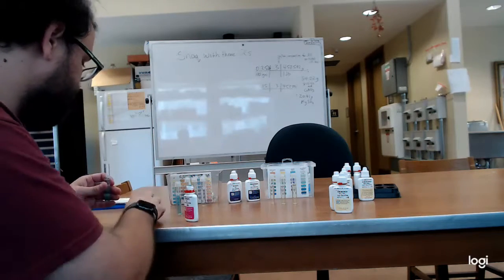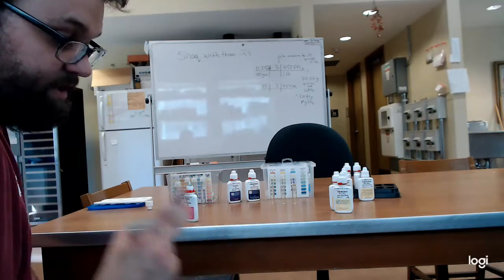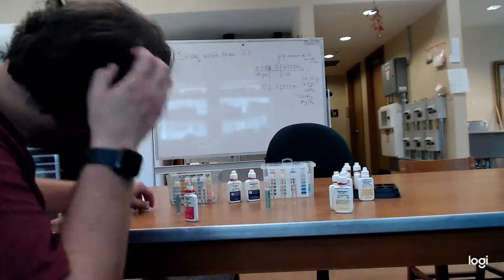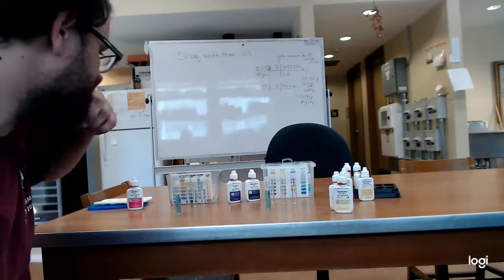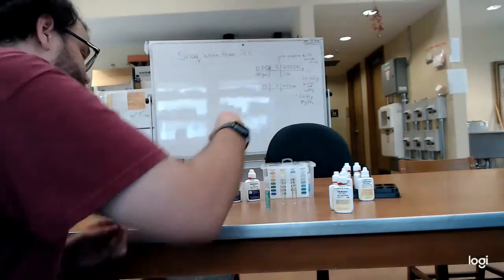So what I'm doing here is a nitrite test. I'm going to start off with ammonia and nitrite because in my opinion those two are the less interesting ones, at least for the brews that we have going. But I did just want to show you every test that I do on these trials. And so I'm just going to be showing it to you back to back.